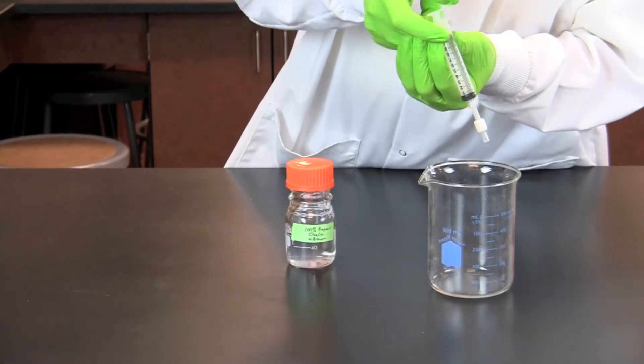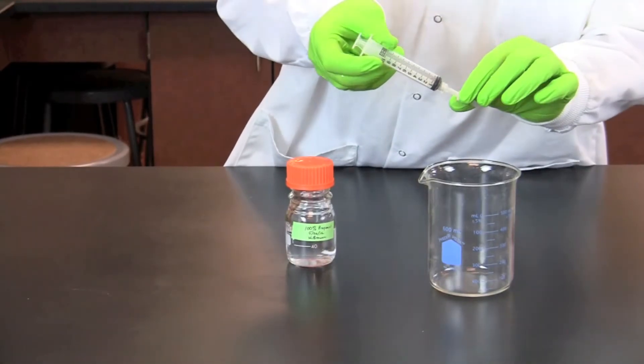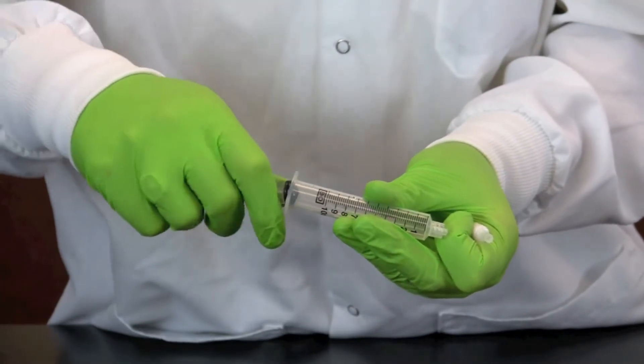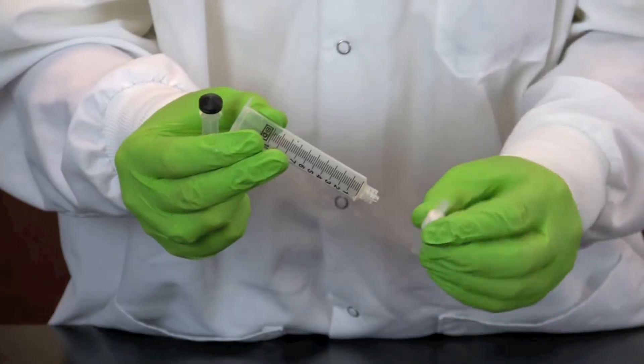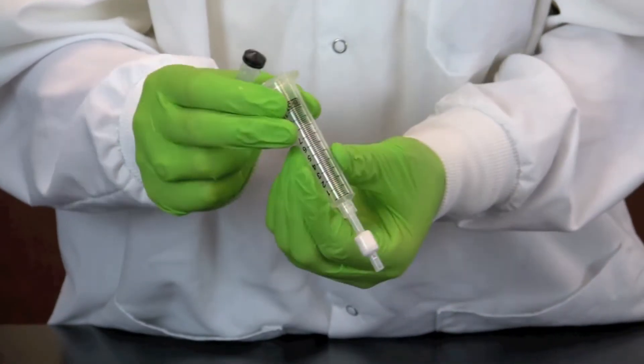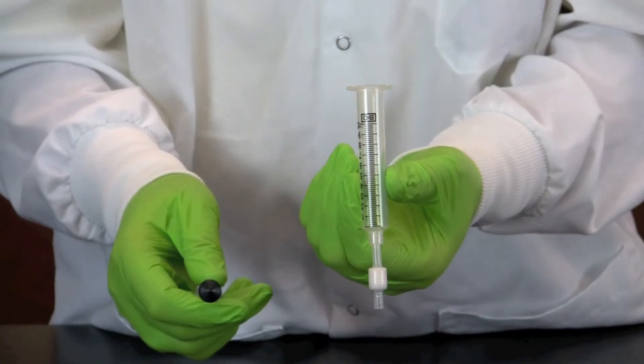Once the concentrated alcohol has flowed through, remove the cartridge from the syringe, pull out the plunger, and then reattach the cartridge. Always perform these steps in this specific order so that the solution flows in one direction.